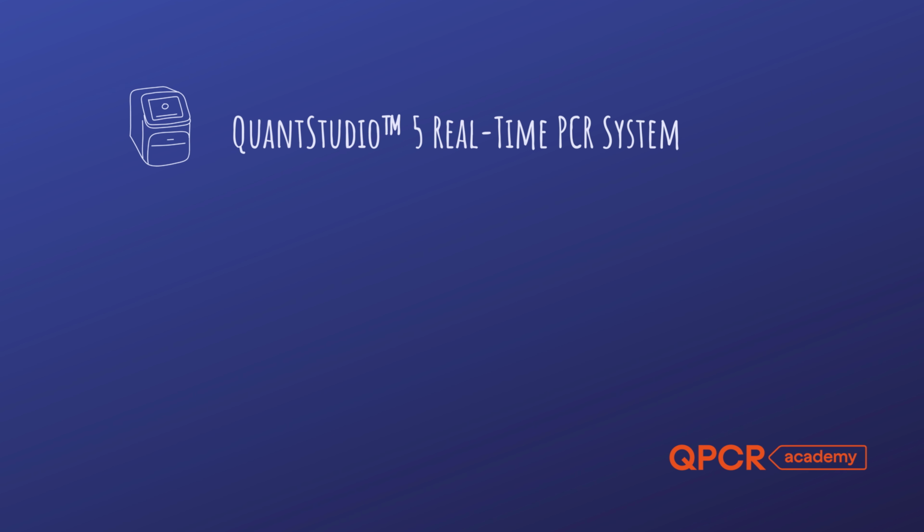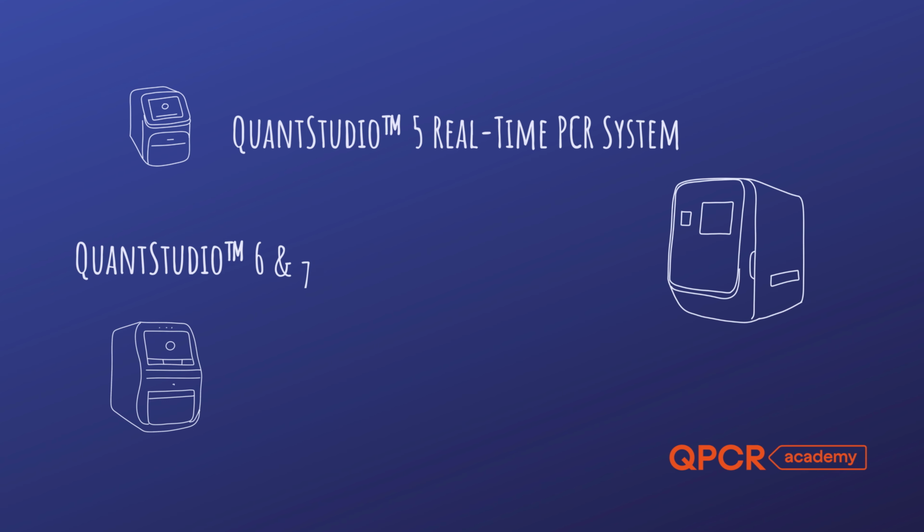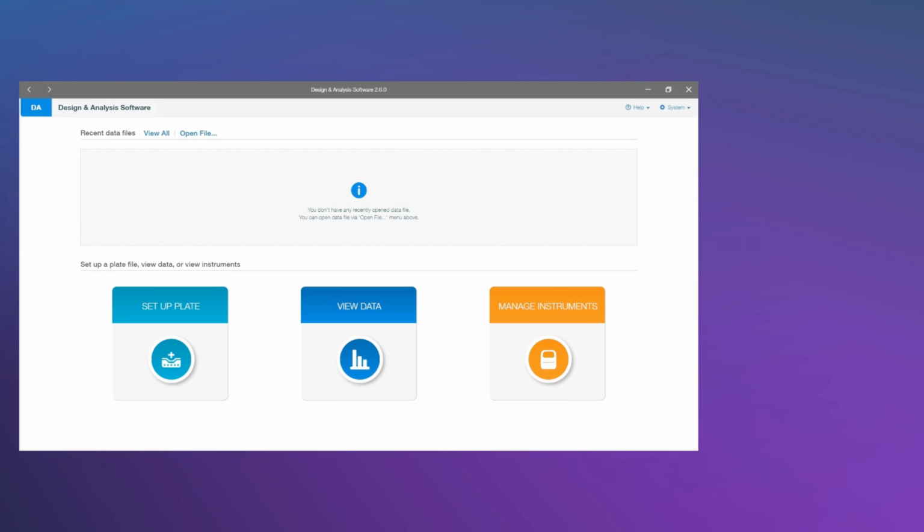I'm using the QuantStudio 5 instrument as an example. However, the same workflow can be easily adapted to other QuantStudio instrument series, such as QuantStudio 6 and 7 Flex, or QuantStudio Pro, as long as they use Design and Analysis Software version 2.6.0.